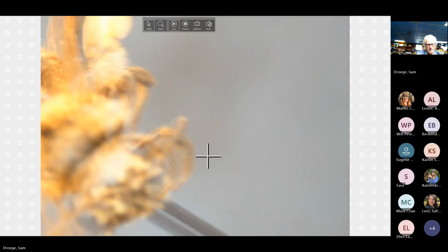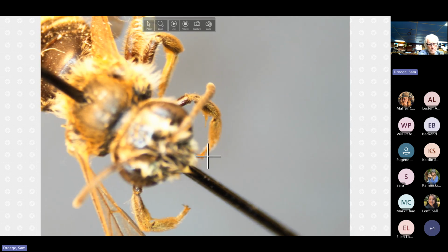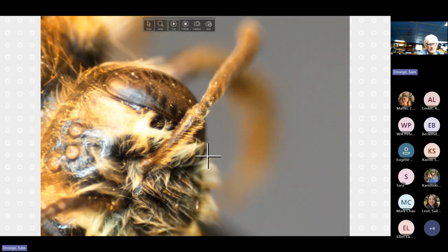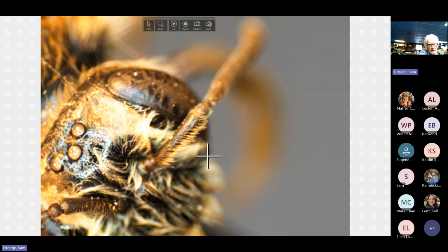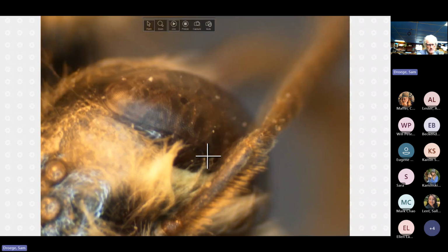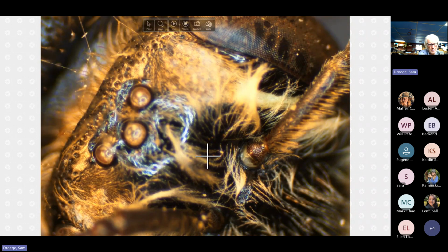And we'll take a look at the fovea too. It may be so glossy, we're getting a lot of sheen coming in. This might be a better view, a little bit better. But the fact that we're getting so much reflectance is an indicator of how smooth the area is. I have a feeling a different specimen will show this better.